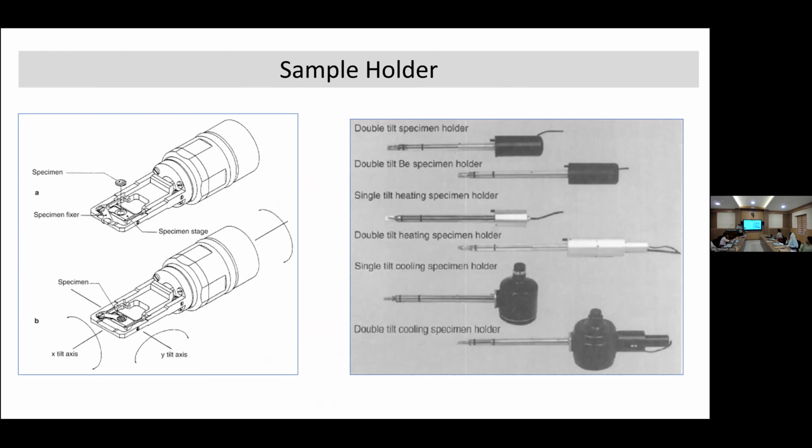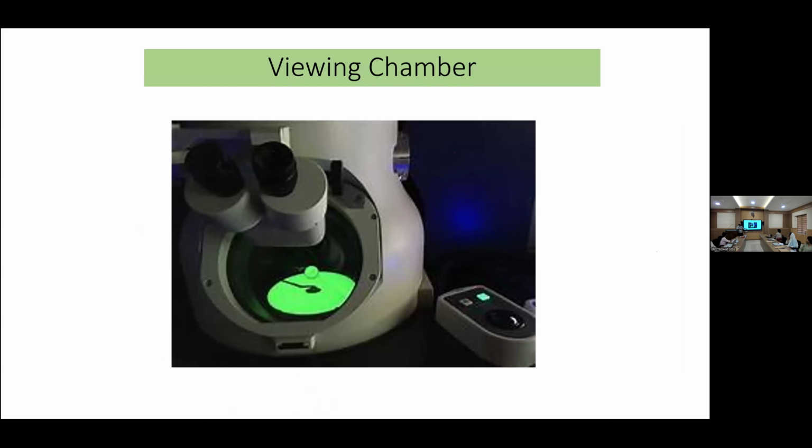So these are the different holders, and this is a TEM viewing screen.